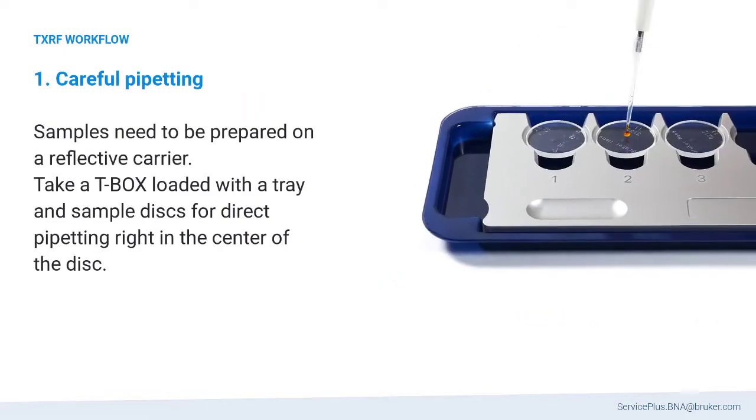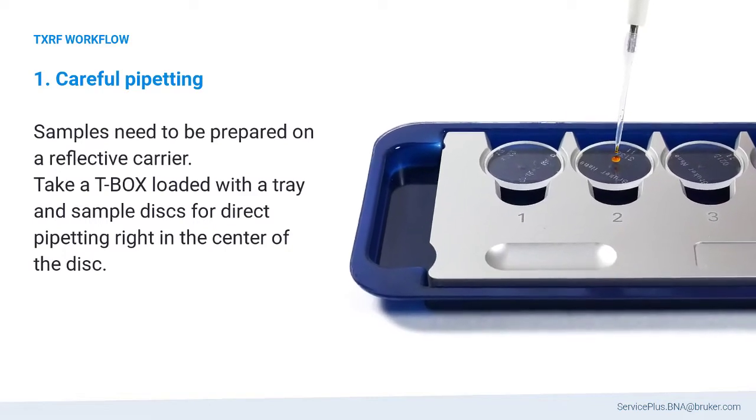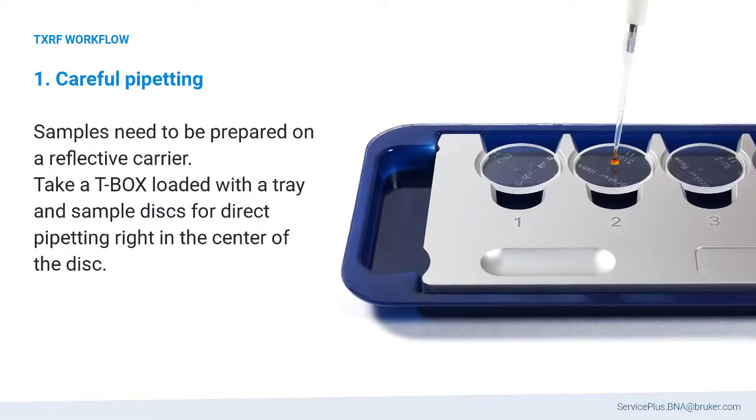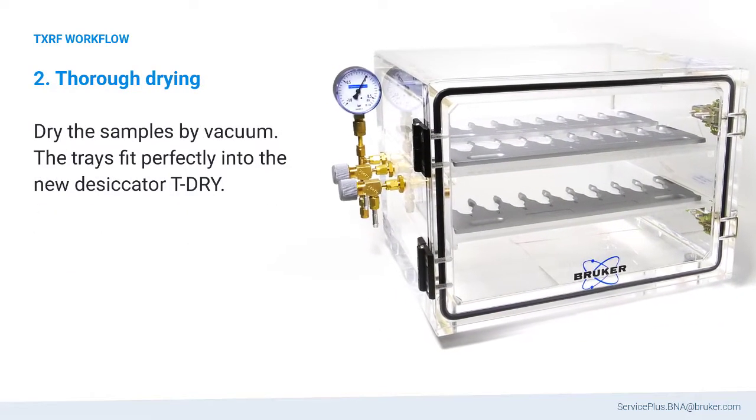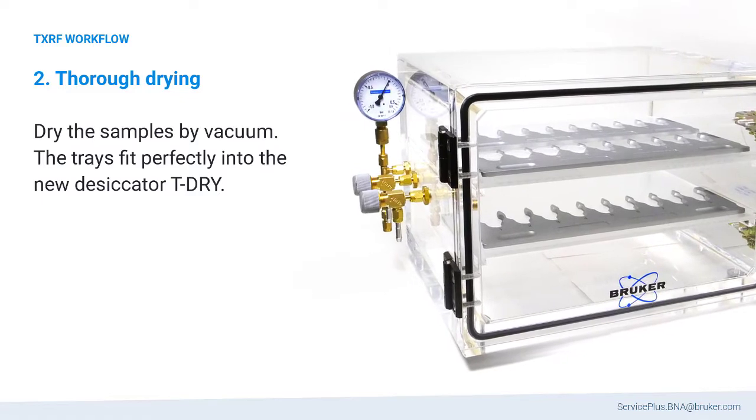Samples need to be prepared on a reflective carrier. A center mark at the bottom plate helps to pipette the sample right in the center of the disc. The sample trays fit perfectly into the new vacuum dryer T-Dry for thorough drying.